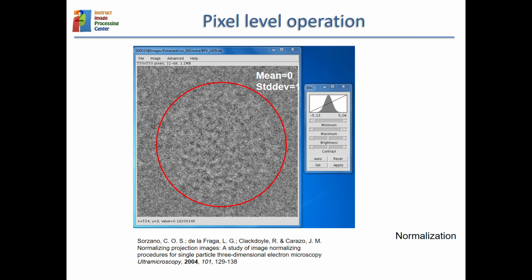And in this paper here you have an analysis of all the different possibilities that at that time were active possibilities, so they were not just theoretical ones, but there was a debate about what was the best way to normalize images. Now it is no longer the case, so we are all normalizing in this way.